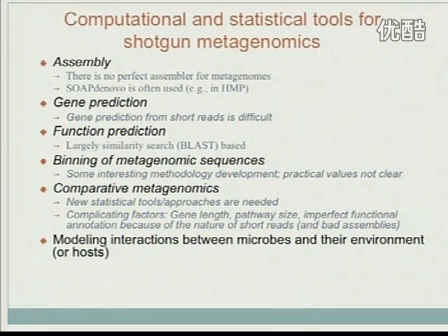Yeah, for that sense, something could be similar. I'm not questioning this, I'm just curious why it's always this one, at least for those big projects. Probably because BGI was involved in the reference. I think I was also involved slightly in the HMP analysis team, and we did try different assemblers. There's really no champion. This one just works, and it does not use that much memory. I think Velvet used a lot of memory.